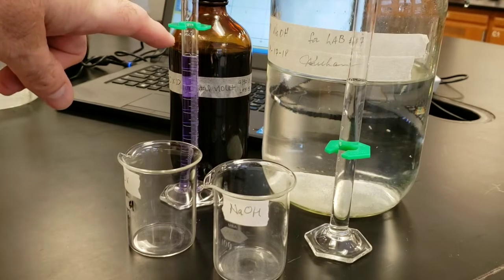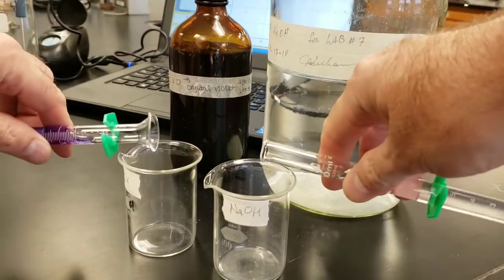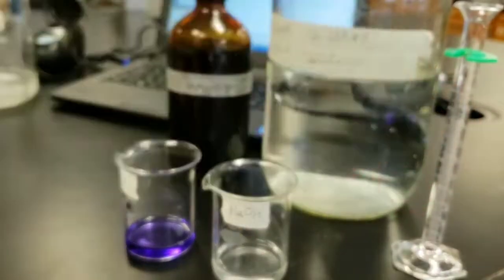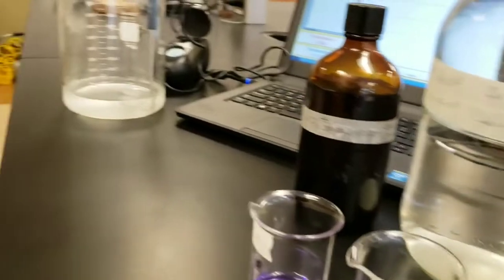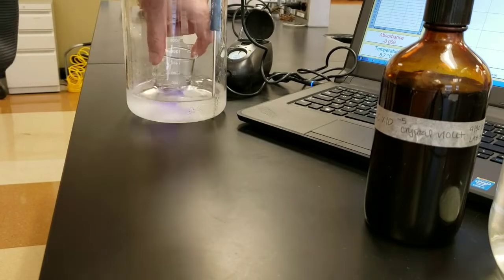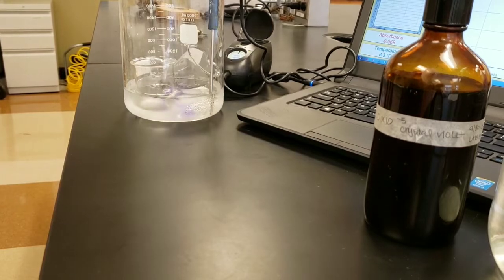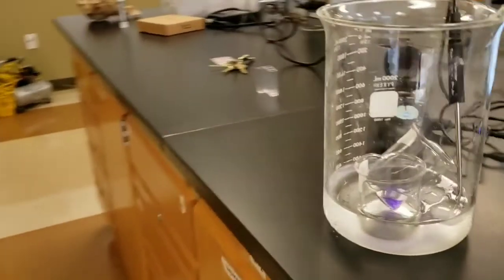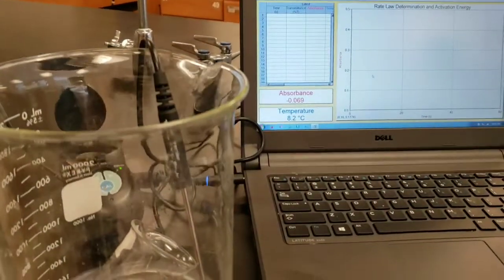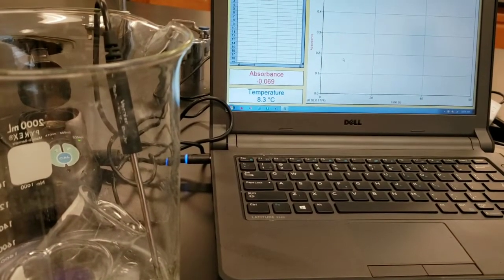Measure out 10 milliliters of the crystal violet solution and 10 milliliters of the sodium hydroxide. Pour those into 2 small 100 milliliter beakers, and then put those beakers into a shallow ice water bath that you've prepared earlier. Those 2 beakers will now sit in this ice bath for several minutes. The temperature probe is in the ice bath, and I can read its temperature in Logger Pro.